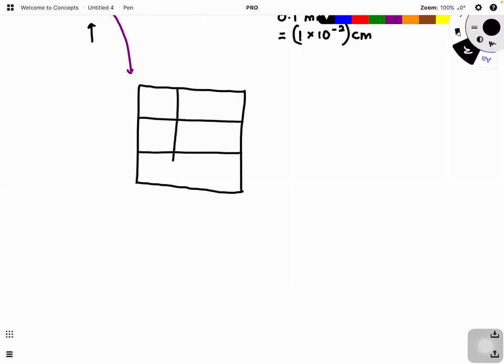It depends on what kind of cells you want to study, but normally we choose the top left, top right, bottom left and bottom right to study. Are you clear? The center, no. We won't study the center.